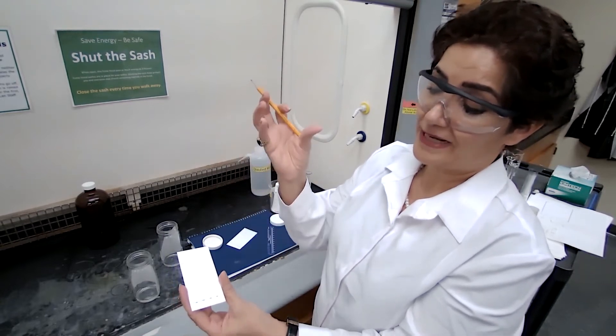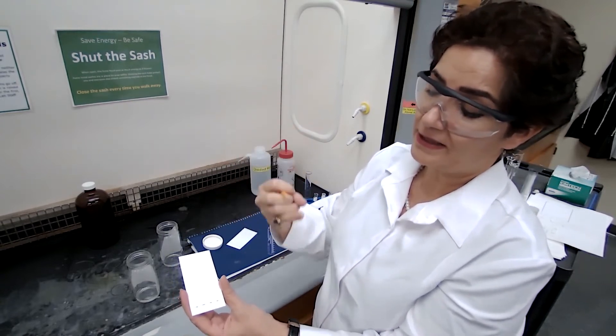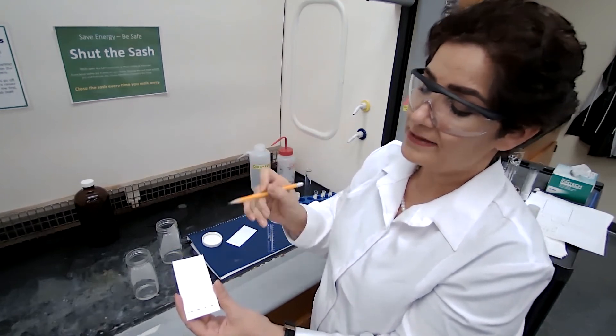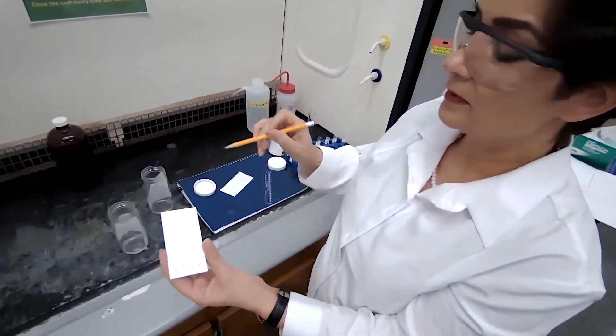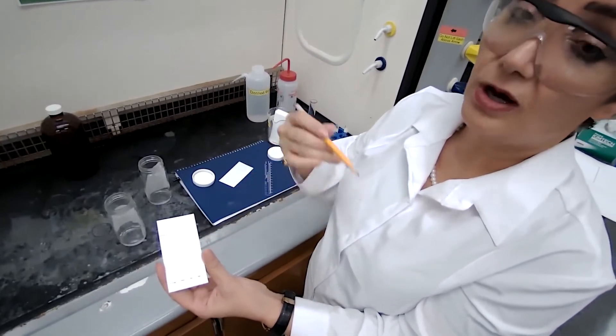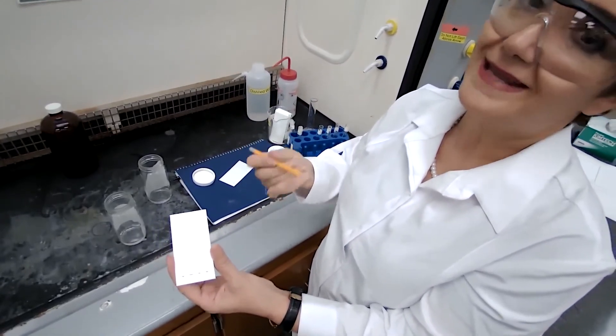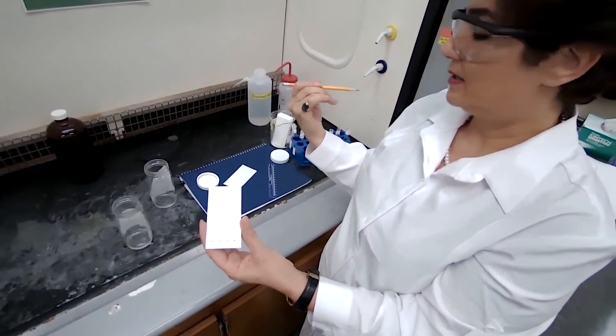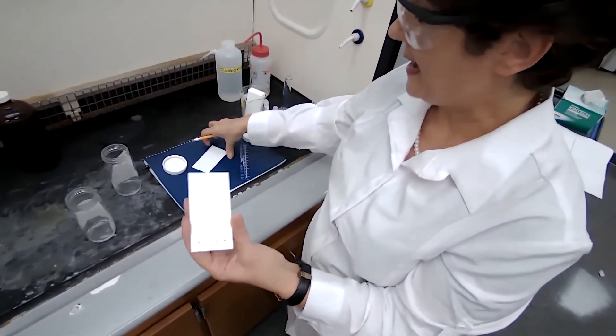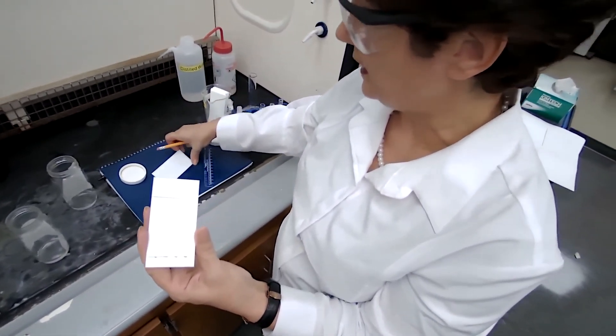Basically the powder that we have embedded here, they are fluorescent and they are shiny and they are going to show up under the UV light. And the sample is going to show as a dark spot, that's what we are going to see under the UV lamp. So let's take this to the UV lamp.